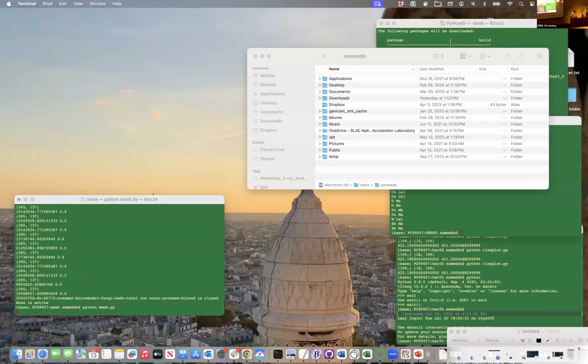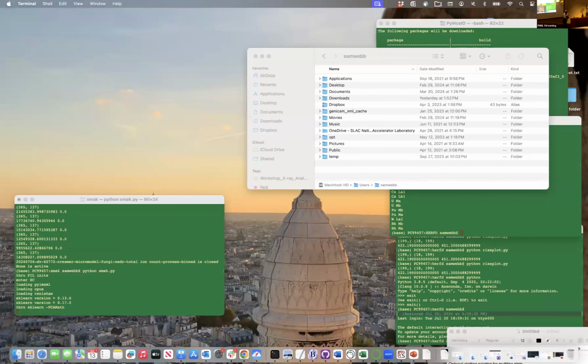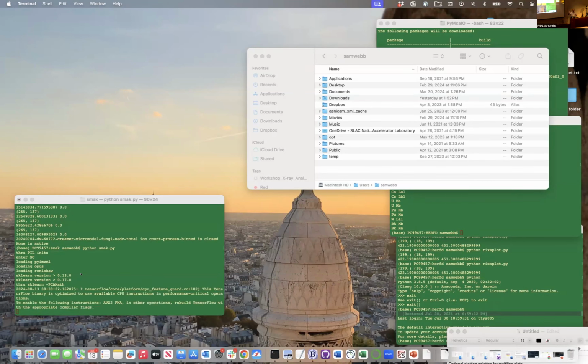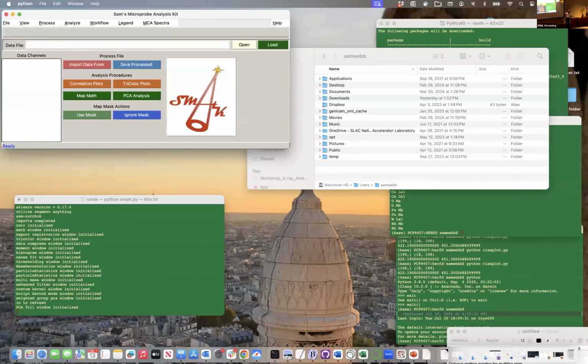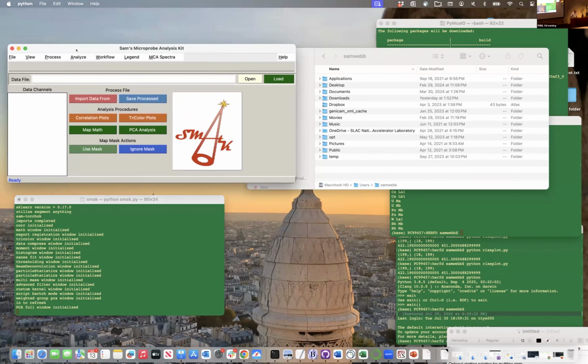So I'm just going to run this from my command line on my Mac. The nice thing now is we have switched from a compiled version to a pure Python. So it's easy to use, open source. You can go ahead and edit it and find errors in it and laugh at the way I program. Those comments are not welcome usually, but you can get a good kick out of how I've progressed.